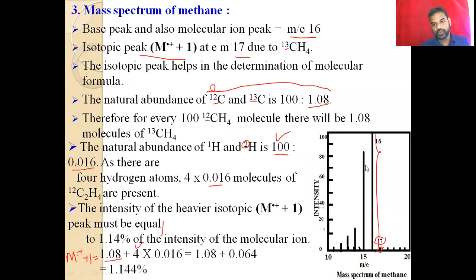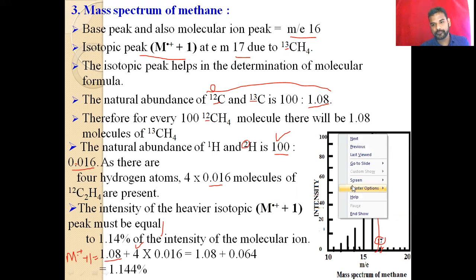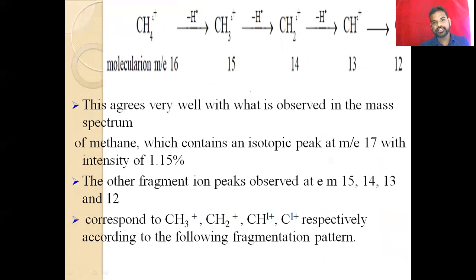Here also 1, 2, 3, 4, so 4 peaks we can expect. This is the base peak, and then these 4 are the fragmentation peaks.